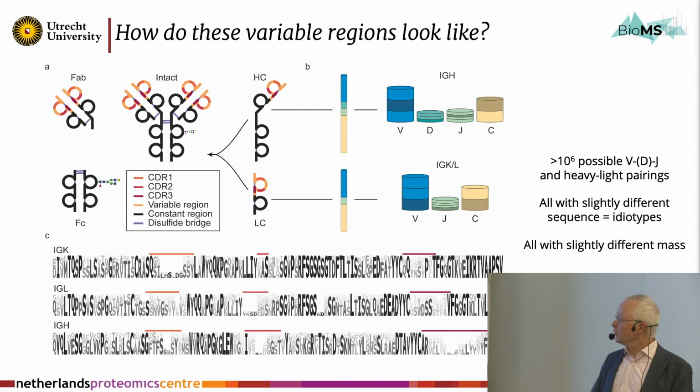It's very small because it can be almost any amino acid. And then you have a hypervariable part here, which is very small here, another hypervariable part here. So this is sort of taking the consensus sequence of about 1 million sequenced antibodies. And these sequenced antibodies have positions that they have all in common, I would say boring. And they have positions that are hypervariable.